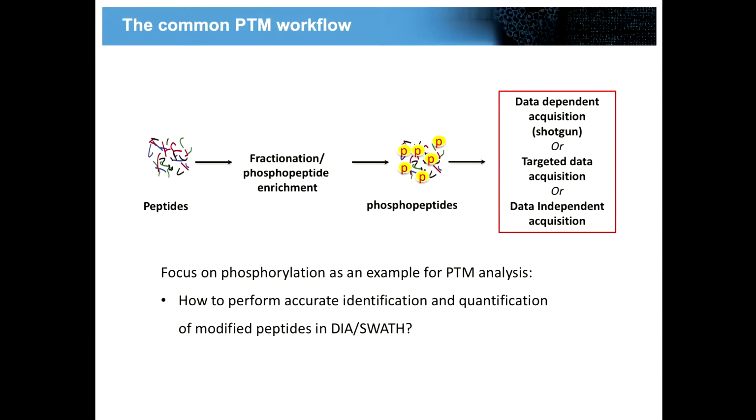in DIA SWATH data. Of course, this talk is not going to be about the first part, so how you enrich phosphopeptides or prepare the samples can be equivalent for any type of acquisition. We're going to start from the point where we've acquired the data.